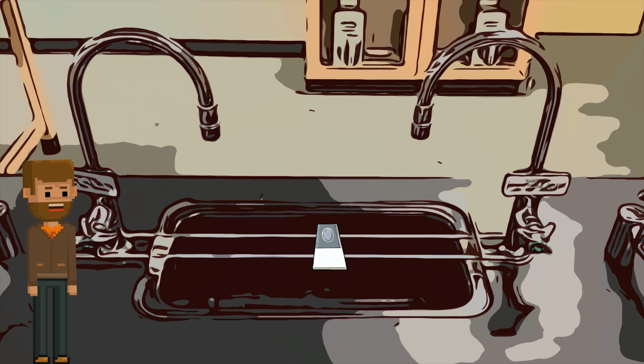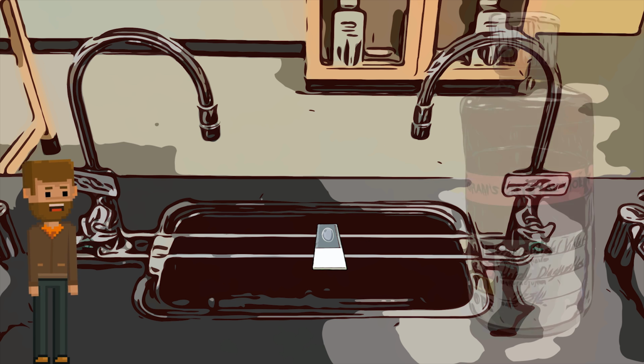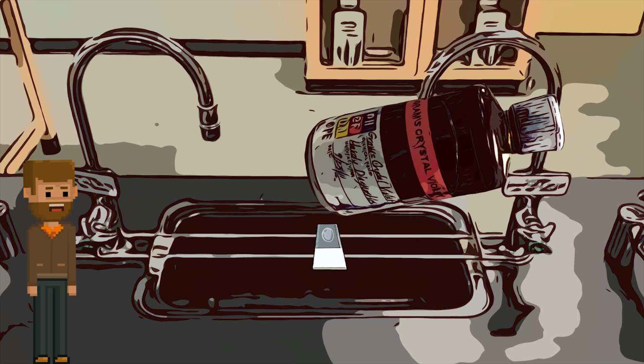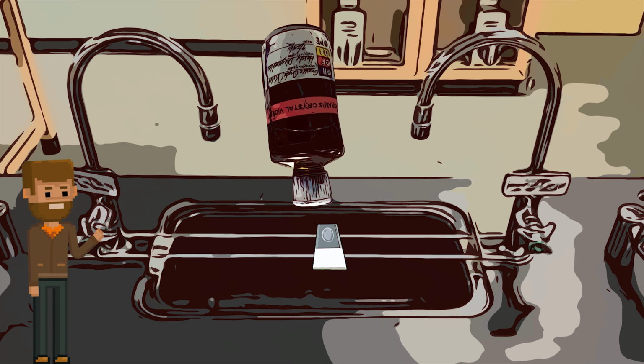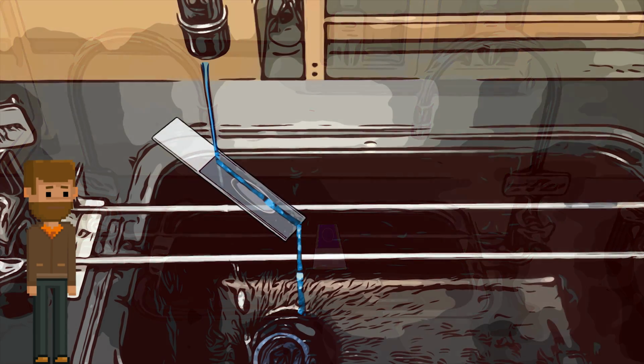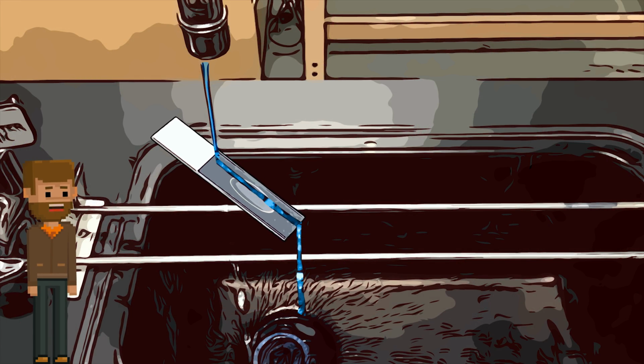Next, we're going to place the slides on a staining rack over the sink. The first stain we're going to use is called Gram's Crystal Violet. You're going to spread this over the slide and let it react for 1 minute. So either you or your lab partner should keep an eye on the clock. Once the minute is up, you're going to rinse the slide gently with tap water.